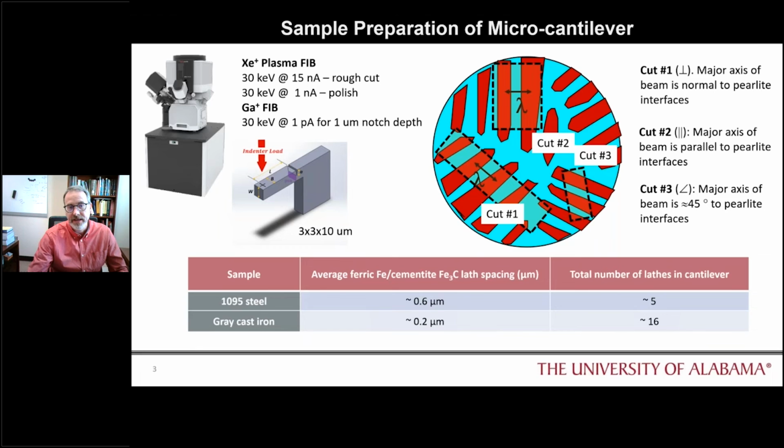We do not see a drop in the load that would be consistent with a brittle behavior, which was very, very surprising to us because we figured by this temperature and these conditions that we would definitely see a drop in the load and a clear, catastrophic crack that occurred. Even though we did see some cracking, it did not manifest itself into a dramatic quantitative drop in the load.